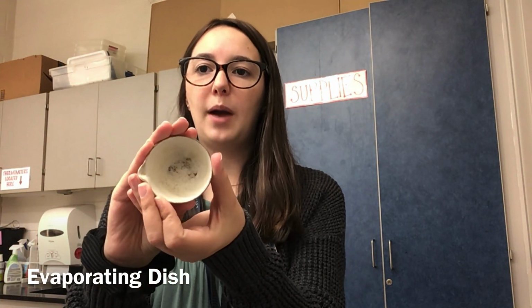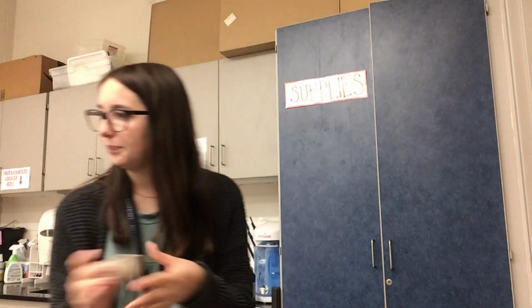Number seven is an evaporating dish. This is what an evaporating dish looks like. These are used when you want to evaporate a substance quickly, so that you can measure it. Typically you will use these if you want to evaporate out any extra water or liquid from a substance.